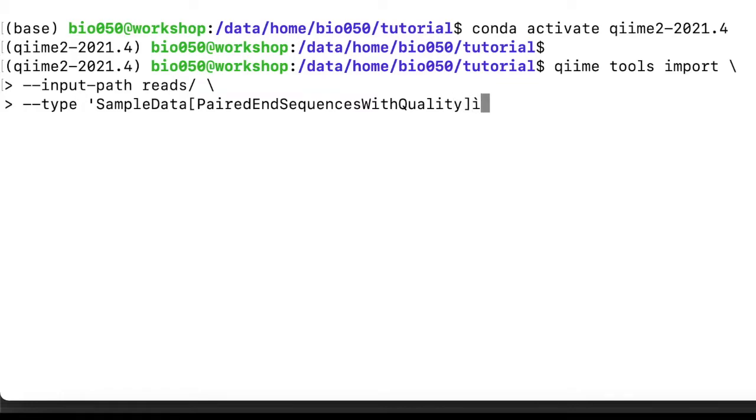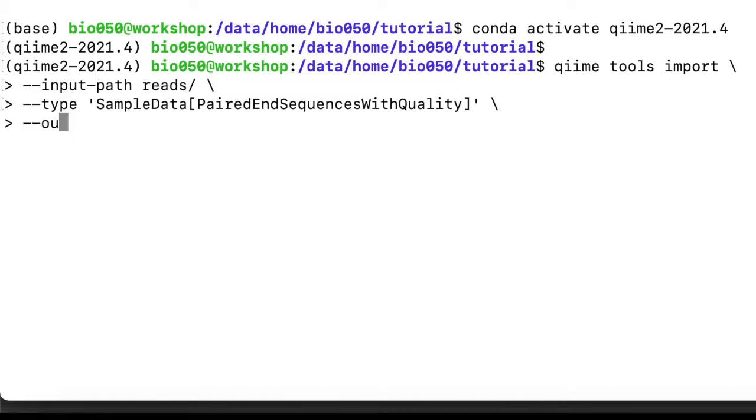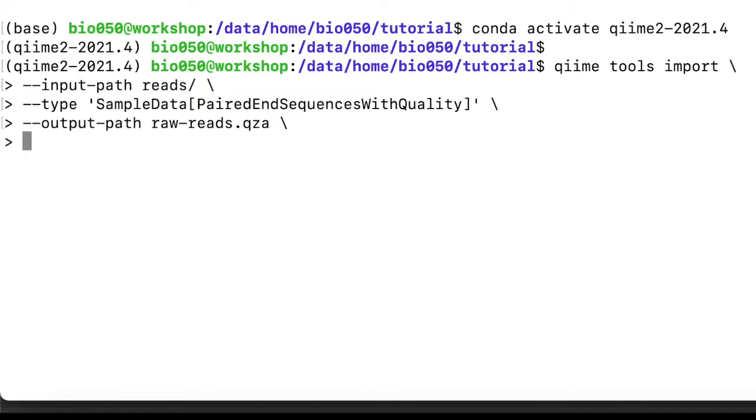So these are sequences that could be FASTA or FASTQ, but with quality, so they are FASTQ files, they are paired-end, and let's add some other specifications. For example, we need to specify where to save the file, output-path, it can be rawreads.qza.